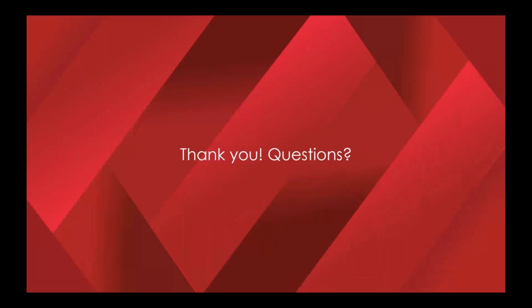And I see there's a couple of questions that are somewhat similar. So here's one of them. This person just bought a system, and they had Bluehill Universal installed 2 or 3 months ago. I saw a couple other people said they upgraded to Bluehill Universal recently. So the question here is, how do I get the latest version of these security enhancements, and do you have to pay for them?